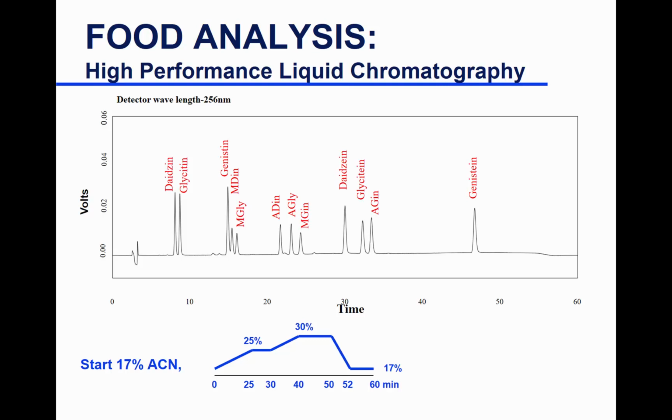delaying them coming out. And more so, this is very important, more so these that are close to each other, the peak might broaden because it's taking a long time, so it's spreading longitudinally. So it might broaden and these become a big wide peak. So we lose resolution. So not only do we push time, and analysis time would be really long, those peaks that are sharply separated might broaden and no longer separate very well from each other.